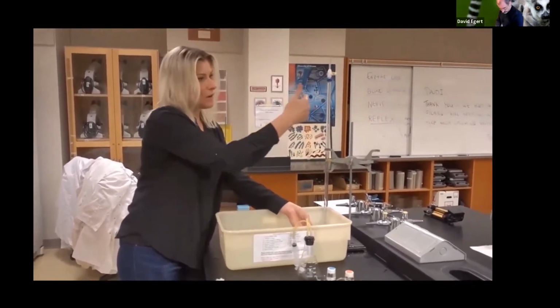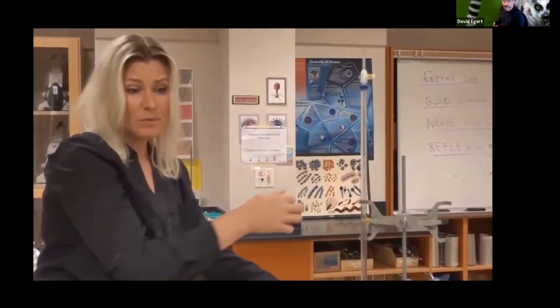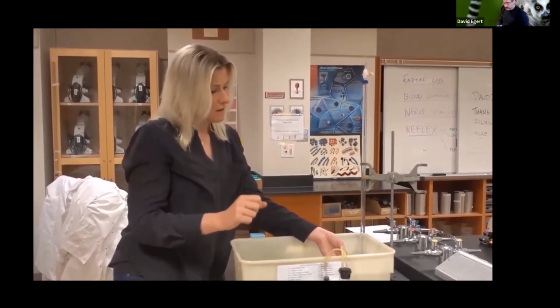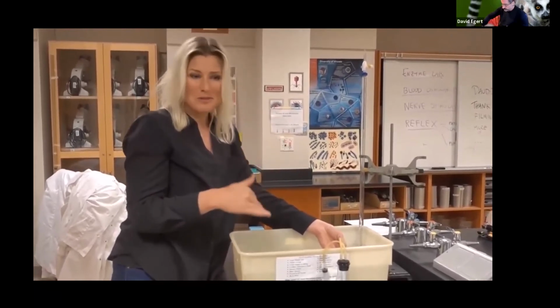And then the person that's reading the graduated cylinder will yell out the numbers, and another person will record it into the lab book. So it's key that you have made a table so it's quick to record times and volumes as it goes along, because things will happen quickly.